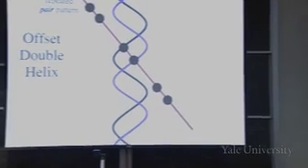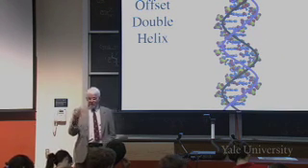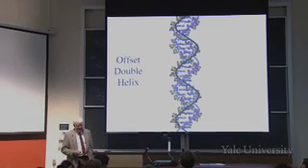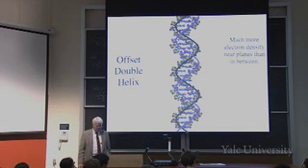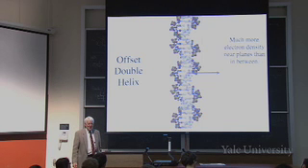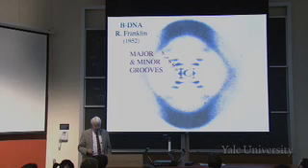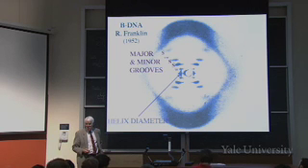So that's that repeated pair pattern that we saw before, and there you see that the outer coil of the DNA, which has phosphorus in it with a lot of electrons, right? That's very much like this helix. Okay, much more electron density near these planes than between them, than halfway between. But there's also much more electron density near those blue planes than in between for the same reason. And that means that you get those spots on the side. That tells you the diameter of the helix.